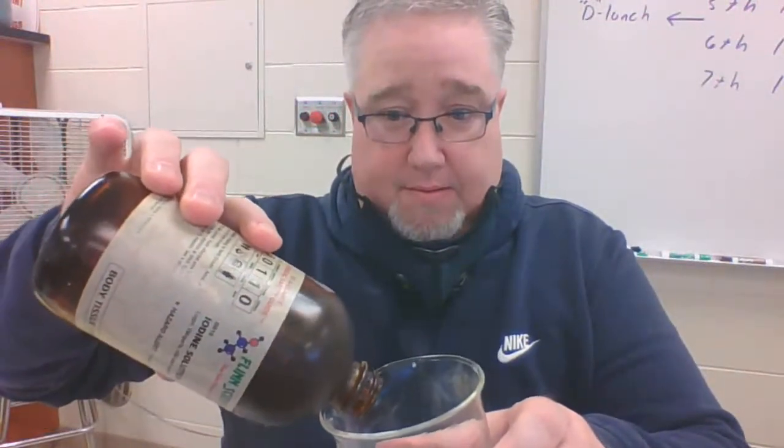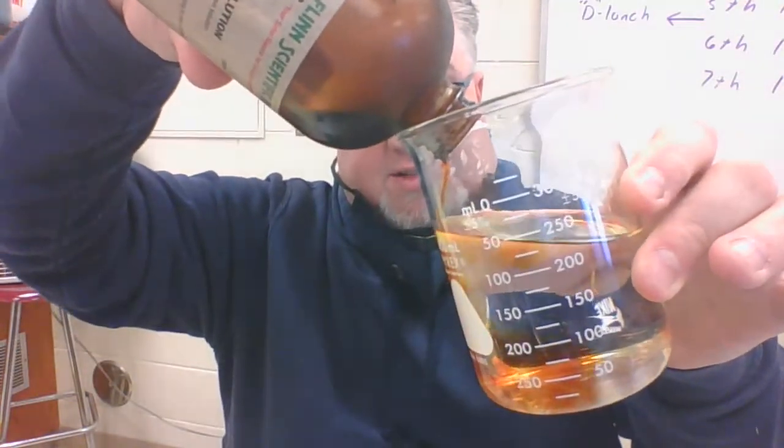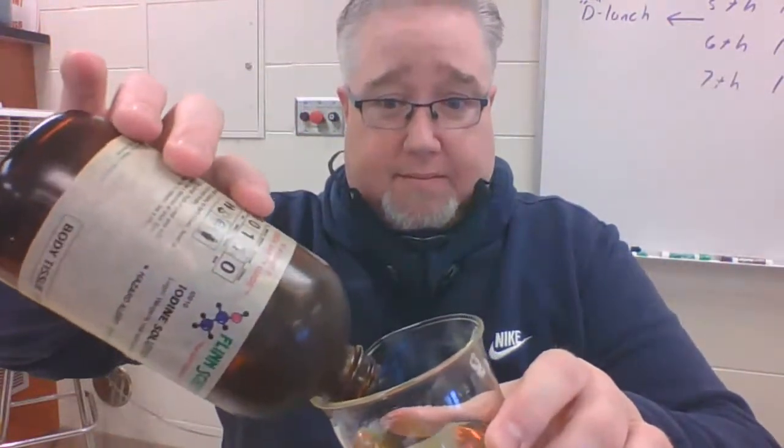So this is just distilled water, just water. Now iodine, once I pour it in here, you'll notice that it has sort of an orangish color to it. Give that a little shake and let it diffuse a little bit. Okay. So there's our little iodine and water solution.